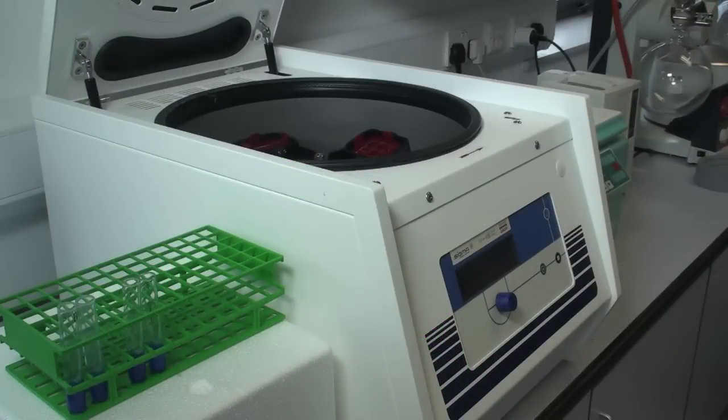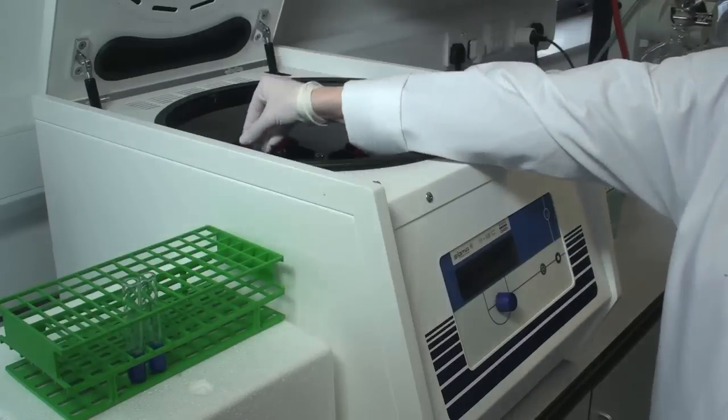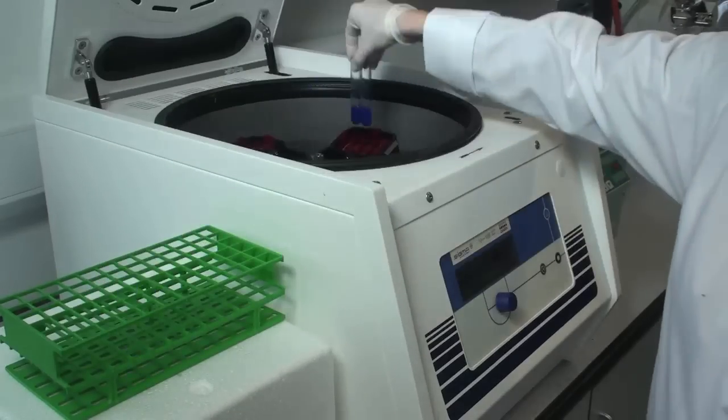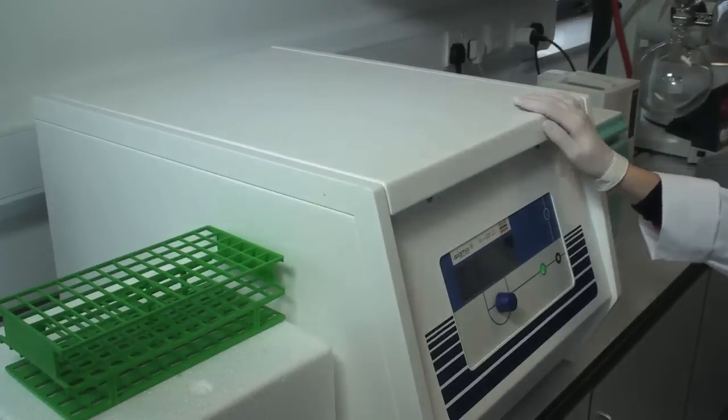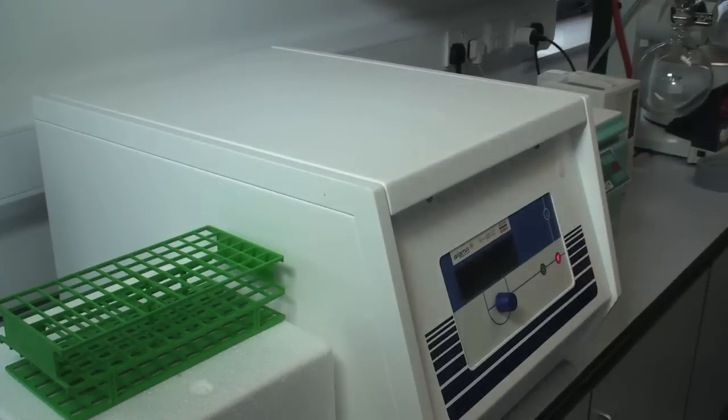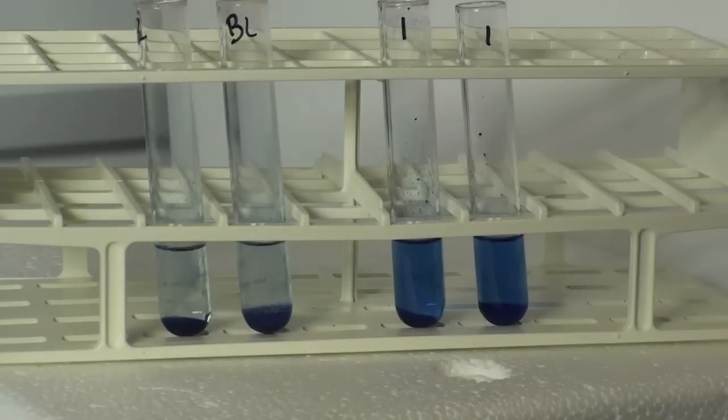Stir the contents again and then place the tubes in a centrifuge and centrifuge the tubes at 1000 g for 10 minutes. Remove the tubes from the centrifuge.